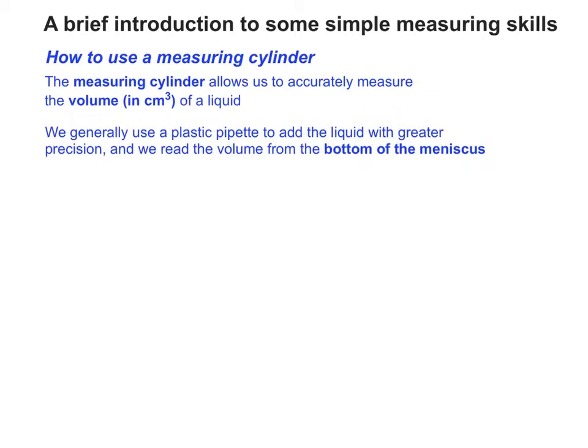There's a little bit of extra precision needed when you use a measuring cylinder, certainly at A-level. We use a plastic pipette to add the liquid with greater precision towards the end, and we also read the volume from the bottom of the meniscus.